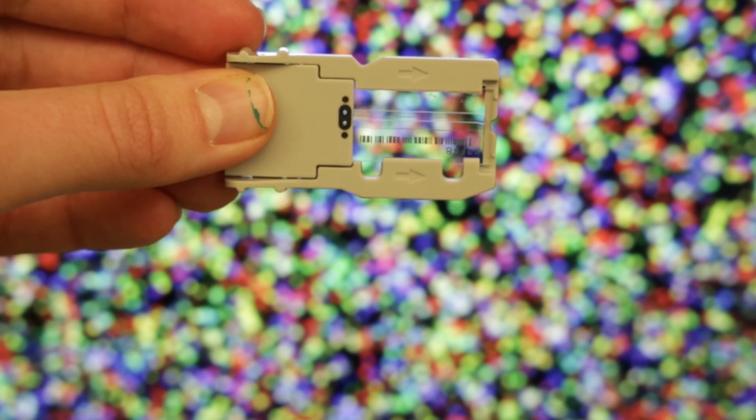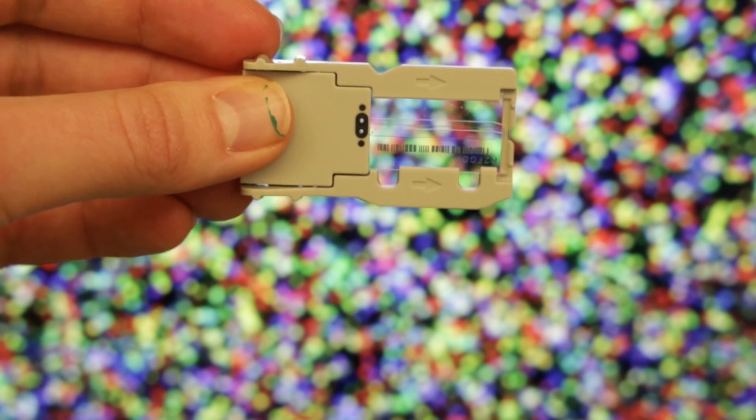So here's the flow cell, and millions of reactions are happening on this flow cell. And the camera is taking pictures of those reactions. And so here's a snapshot of those reactions occurring. You see lots of colors here.